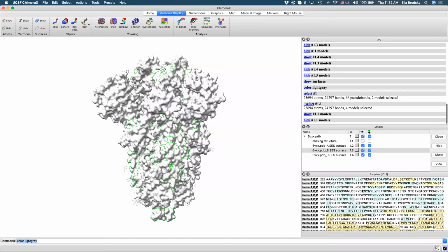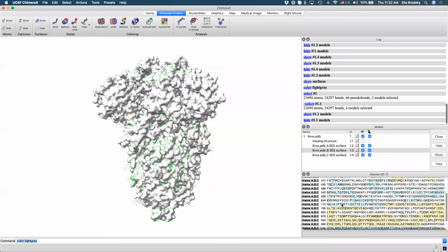Okay, I will just tell you from experience, you're looking for around 680, right? So here you have these positions. And remember, we're looking for QT, QTN. Okay, so tell me when you found the QT, QTN sequence. Okay, it's right there, QT, QTN. All right, great. So QT, QTN, let's select this.